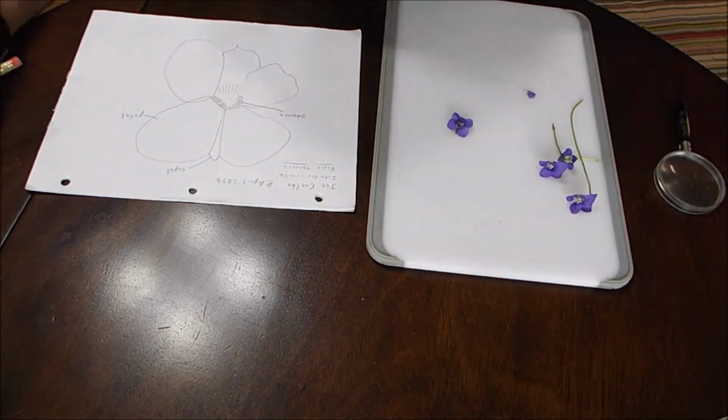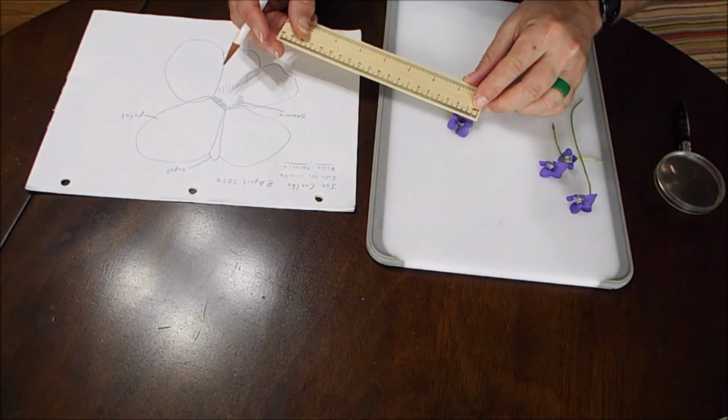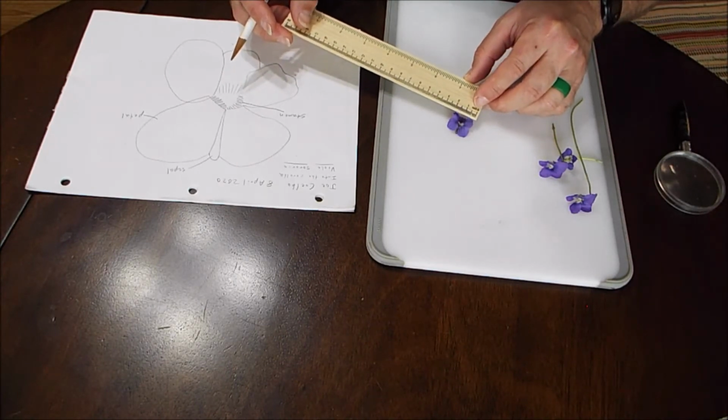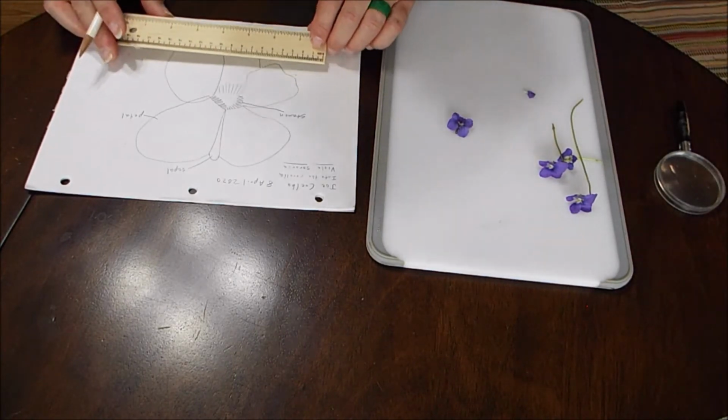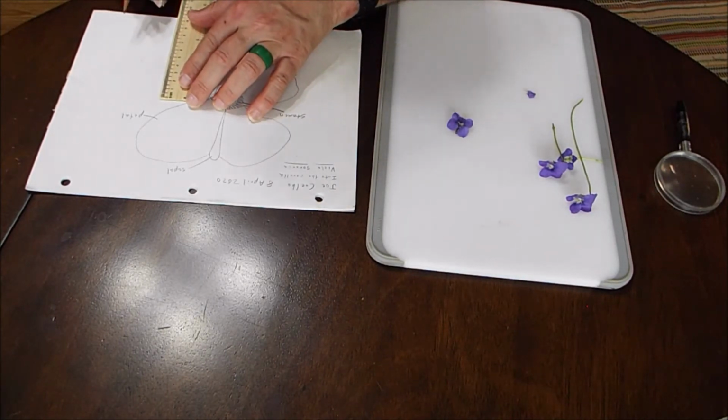And I still need to put a scale on it. So I'll get my little handy measuring device. And it turns out the width of the bottom two petals is 2 centimeters again. And I can do it that way. I could do it a lot of different ways.